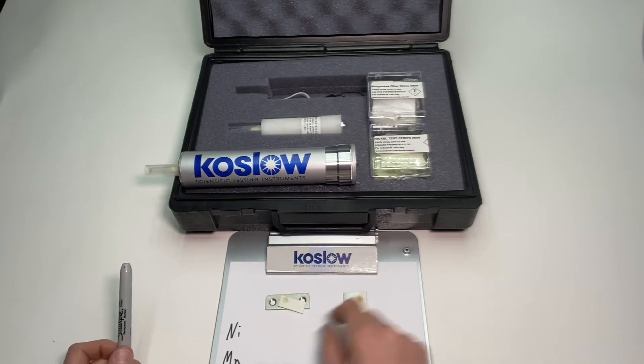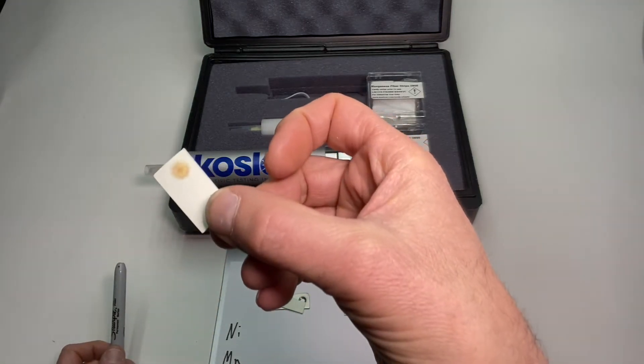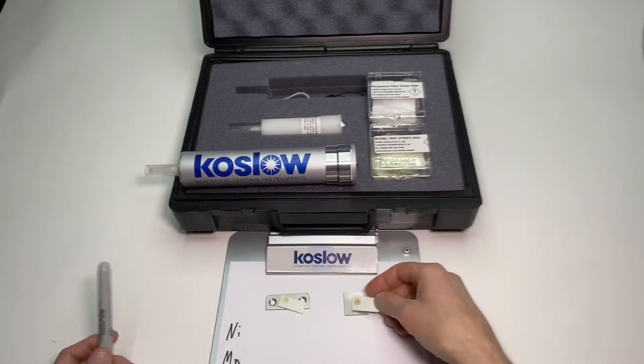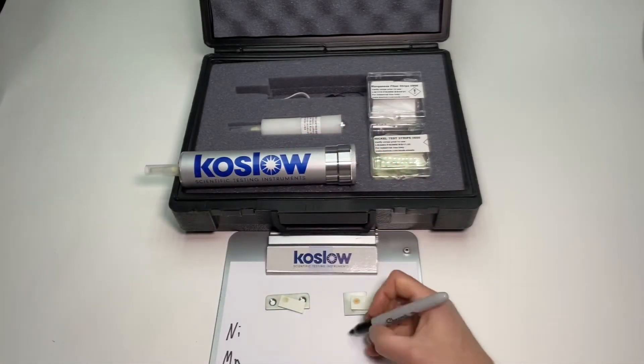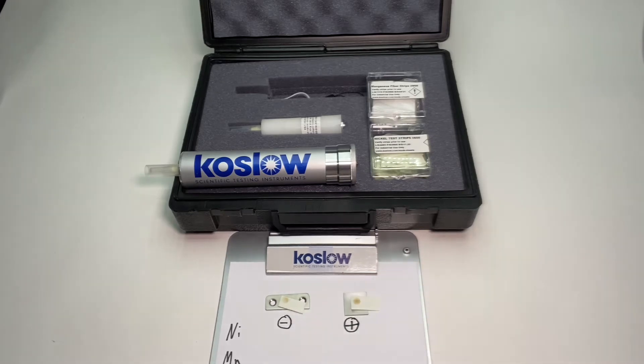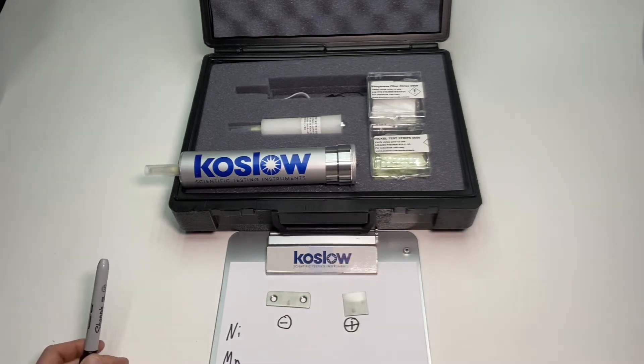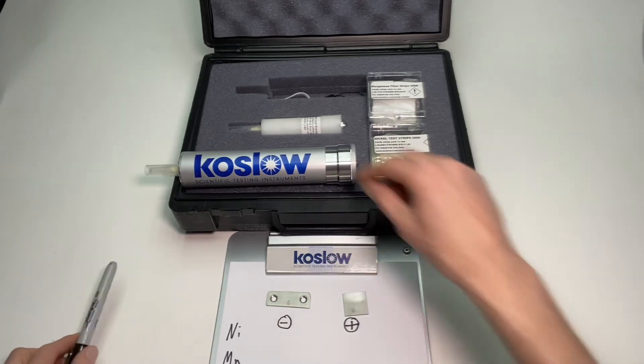This one got a pink spot, and this one got hardly anything — it looks a little bit brown. If you look carefully you could see this is a definite positive result for nickel content. On my little chart here this gets a plus sign and this gets a minus sign.